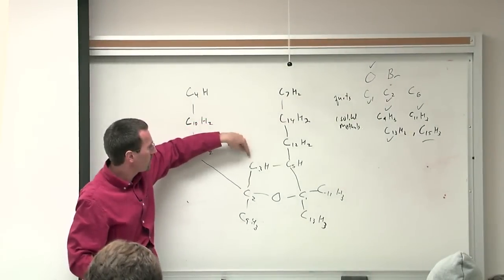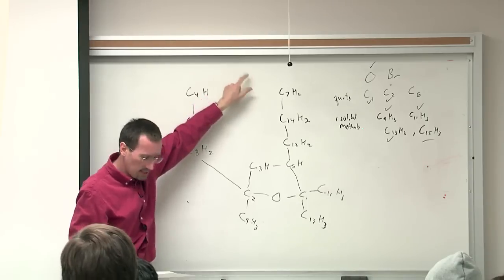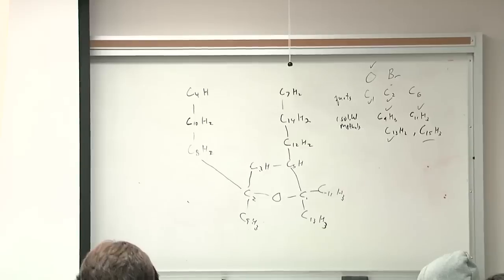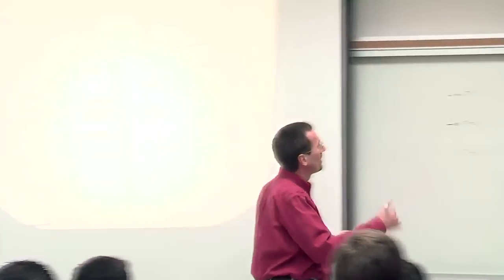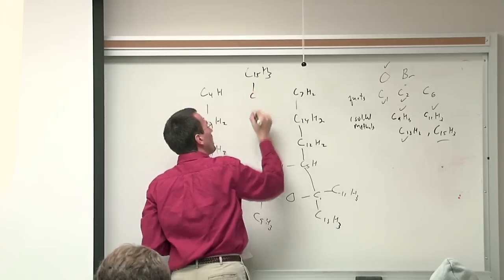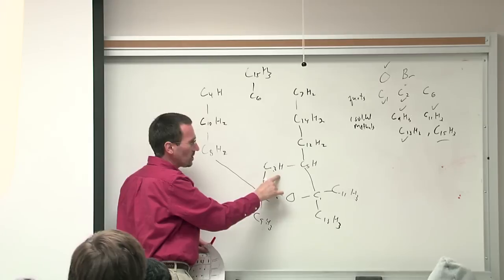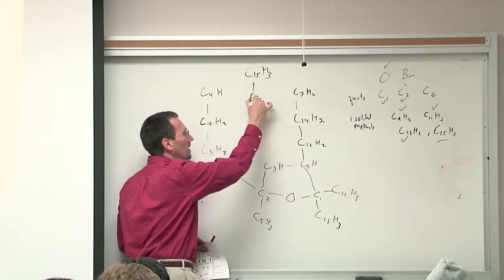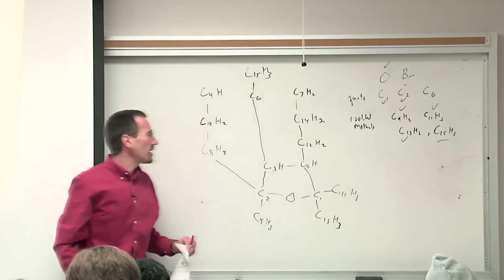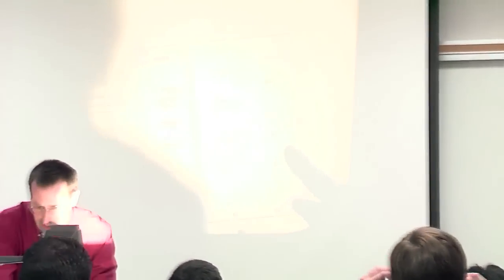And that methyl is isolated, so that's going to be on the quat. That's going to be on the C6. So in other words, we have our C15H3. We have our C6. If we're getting a cross between CH3 and C15H, that's got to put it in over here. Now, if you're having trouble coming at it that way, you can just look at these remaining three cross peaks, which I'll do in a moment.